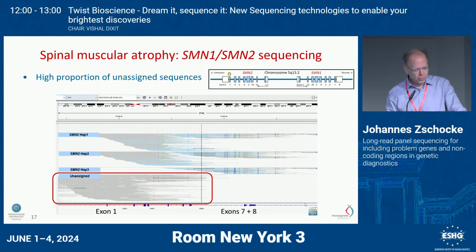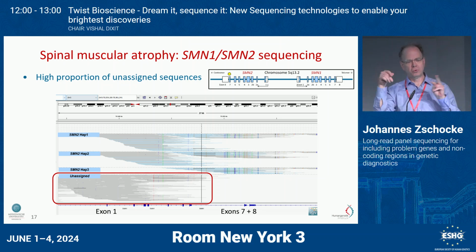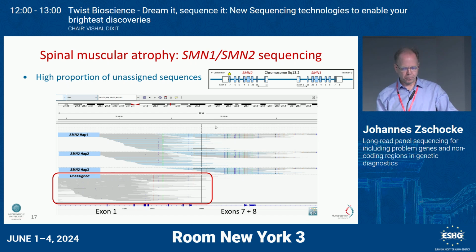So I think if you be able to really group this together and see this must be the connection from the one haplotype to the next, we need to get a method in which we can kind of make a contact of 2 and 1, SMN1 or 2, here it's SMN2 copies, and then we are flying. Then we don't need parents, no family results.